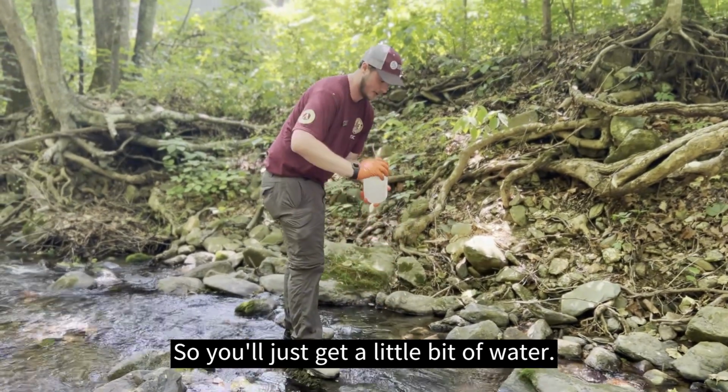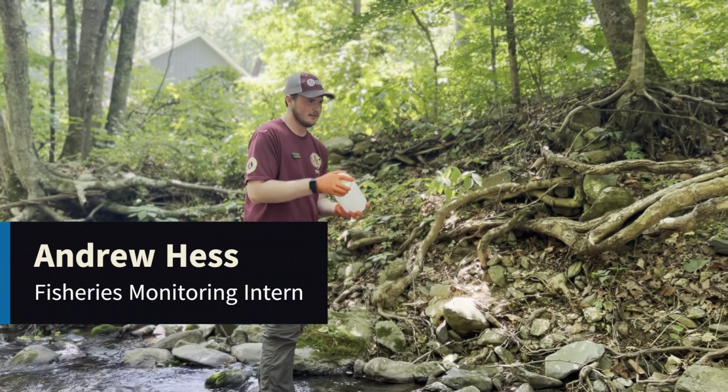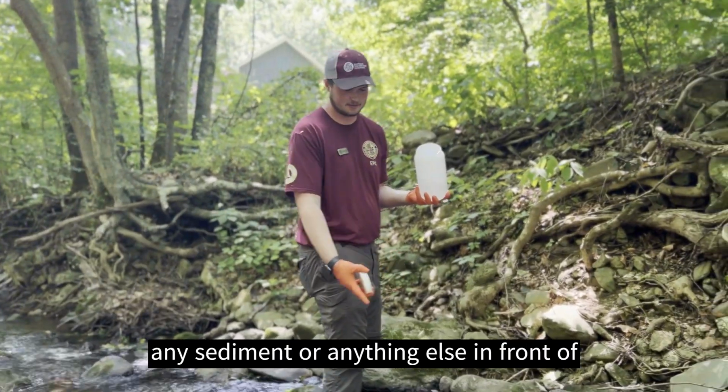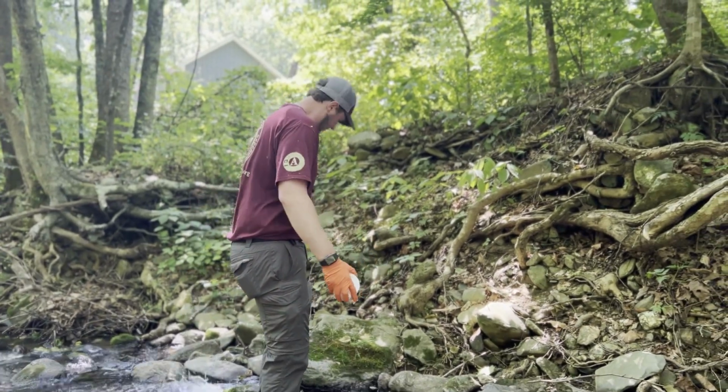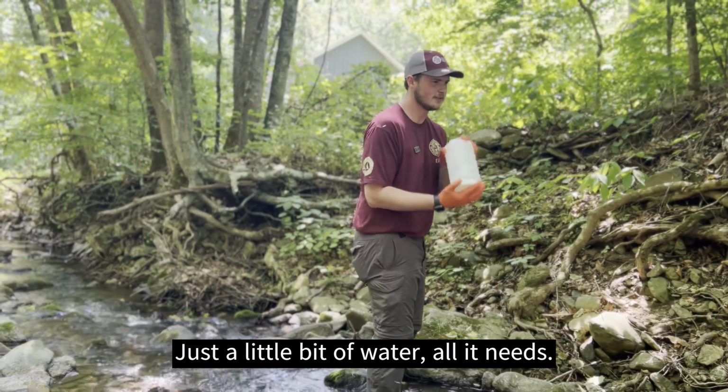You'll just get a little bit of water. Put the top on, give it a little shake, and you're gonna dump it behind you so you don't pick up any sediment or anything else in front of you. So, just a little bit of water, that's all it needs.